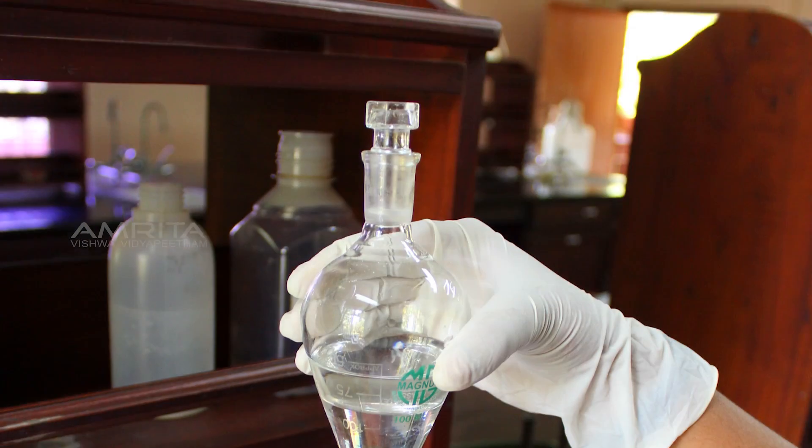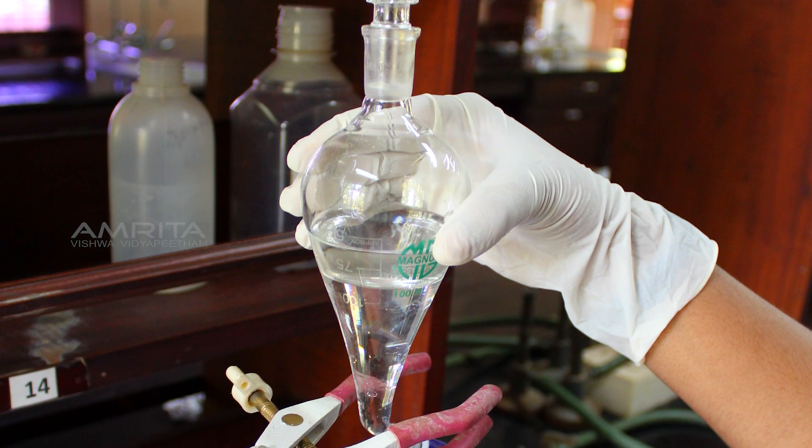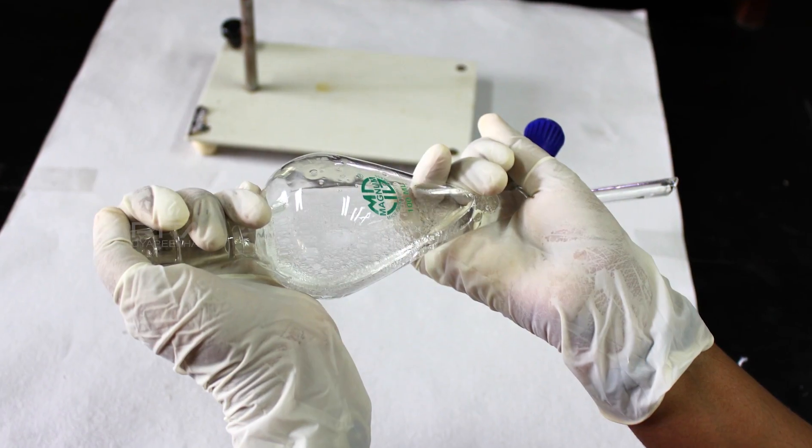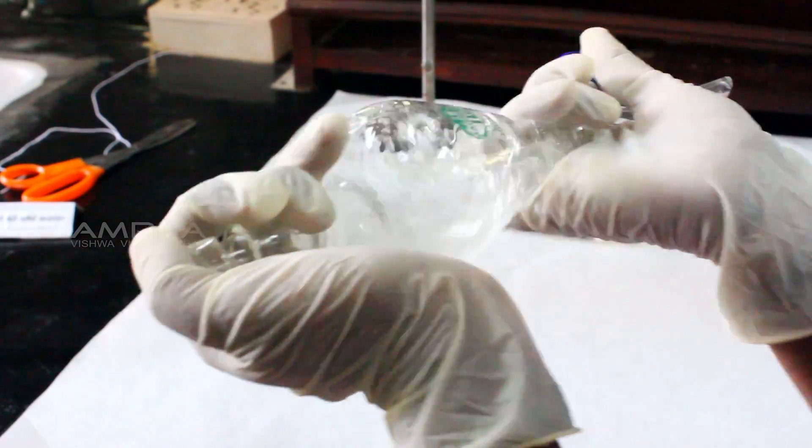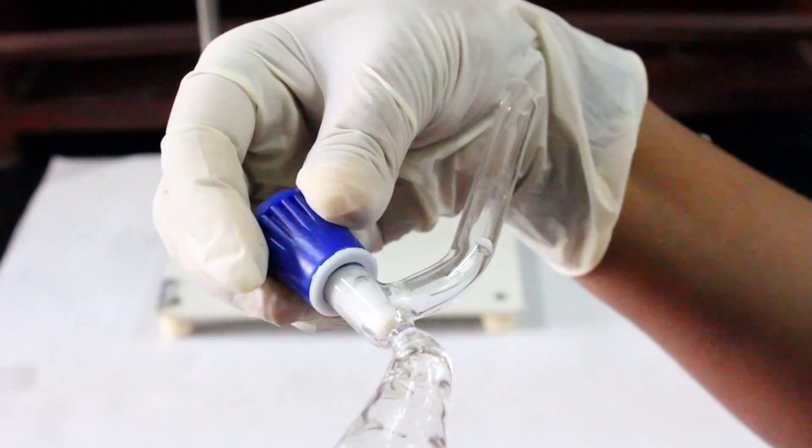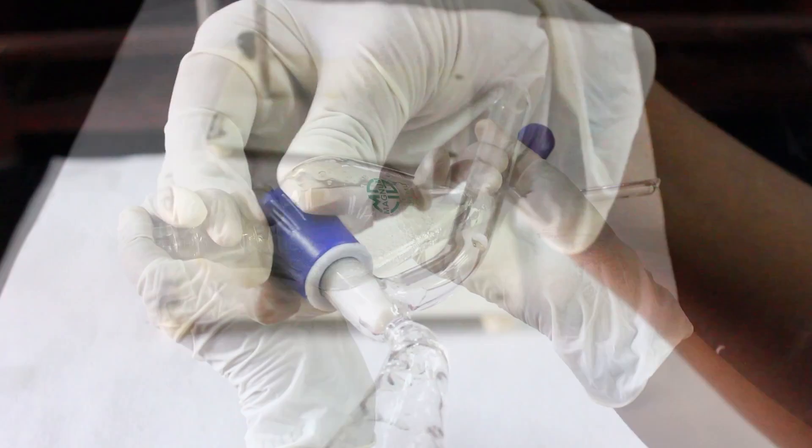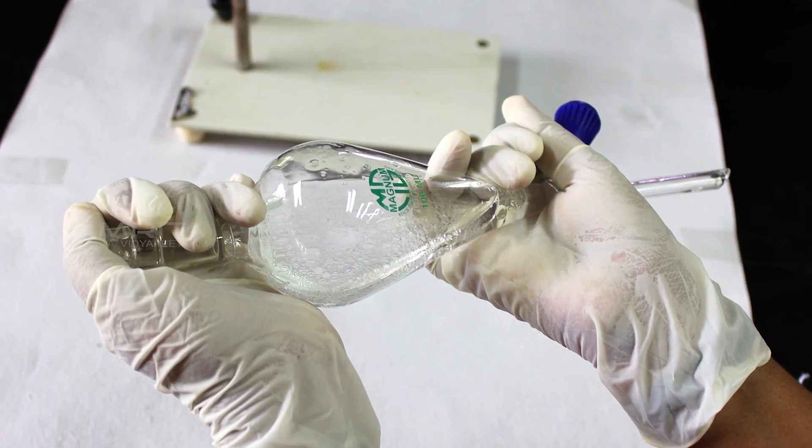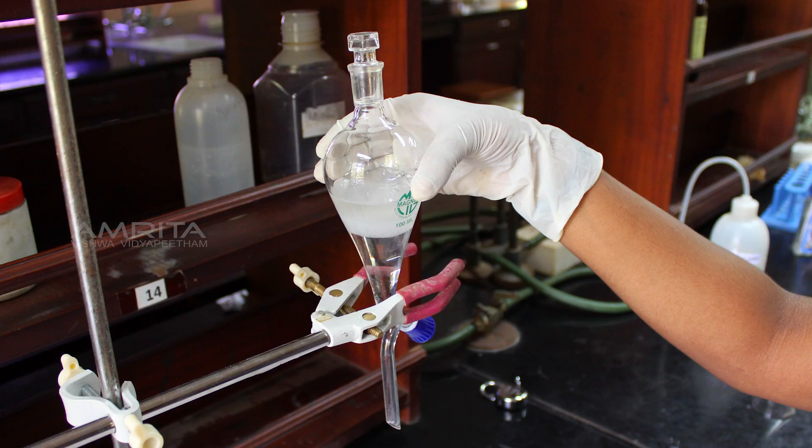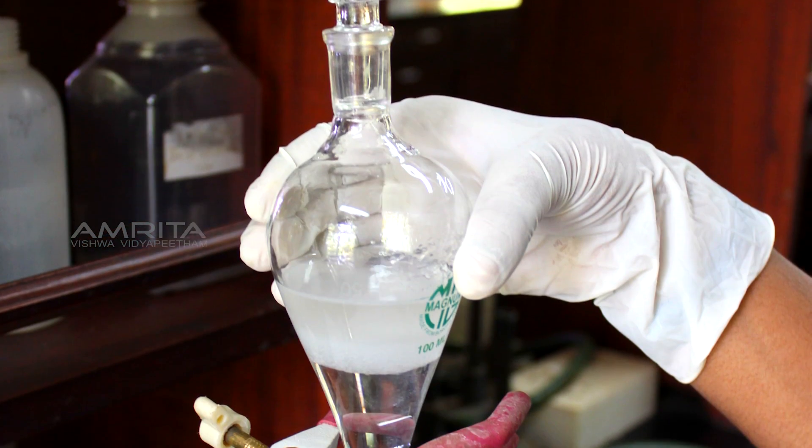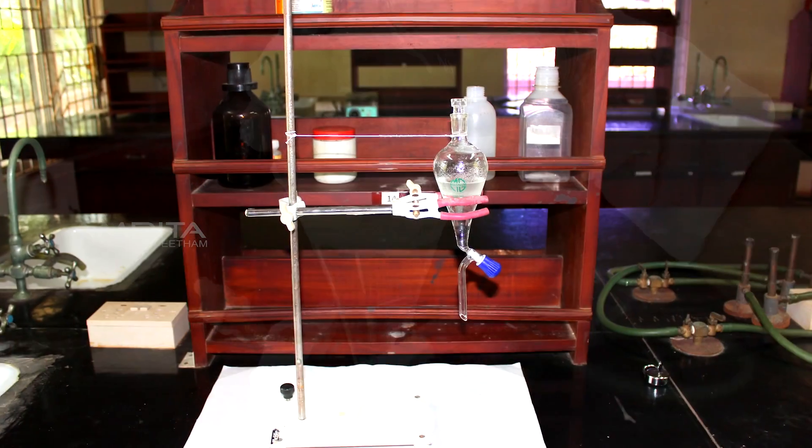Now take the separating funnel from the stand. Invert the funnel and shake it gently, and slowly open the stop cock of the funnel to release the pressure inside the funnel. Again, place the separating funnel in the stand and allow the two liquids to separate completely.